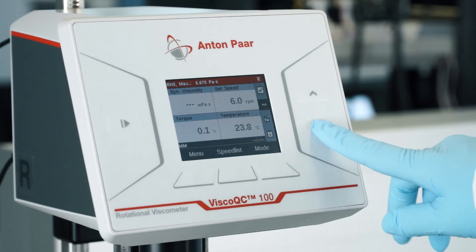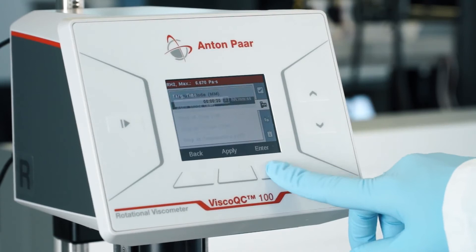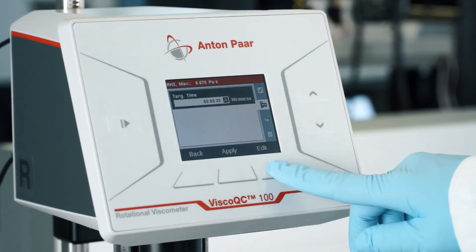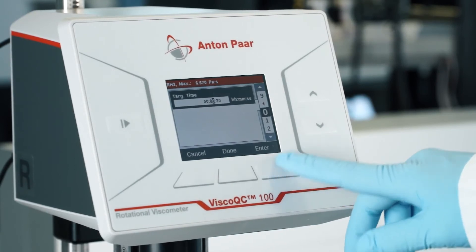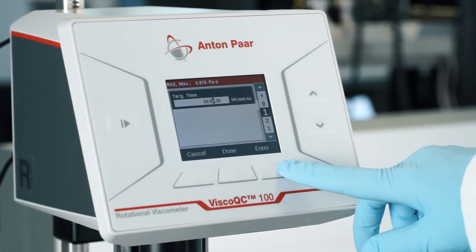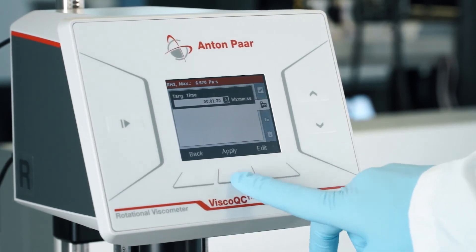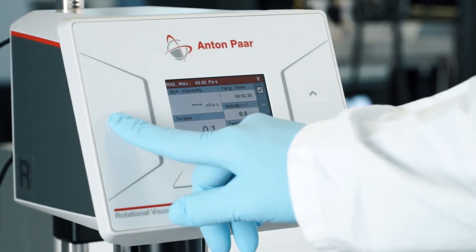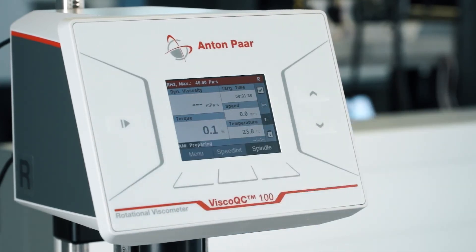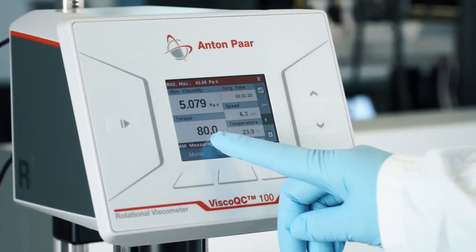To change the mode of your Visco QC100, select the second icon on the right side of the screen and choose your desired mode. Auto Mode — Anton Paar's unique True Mode feature — should be used if your spindle-speed combination is unknown for your sample. You can enter your desired target time for the measurement. Visco QC100 then automatically adjusts the speed to a torque value of approximately 80%.